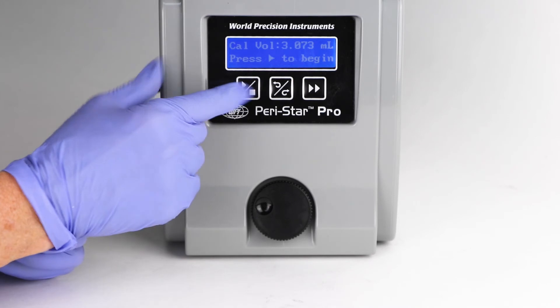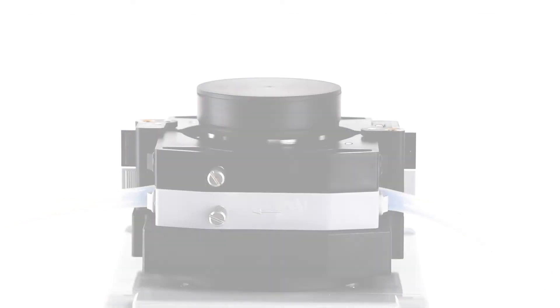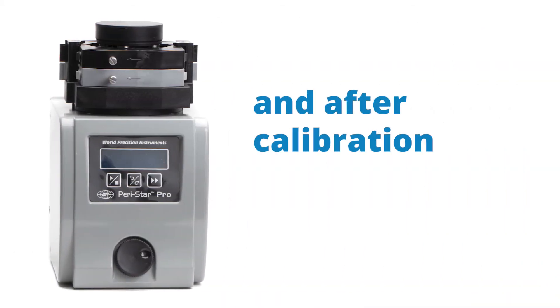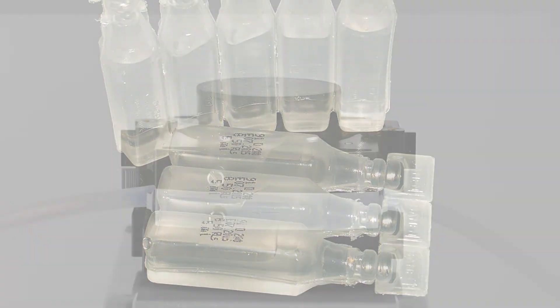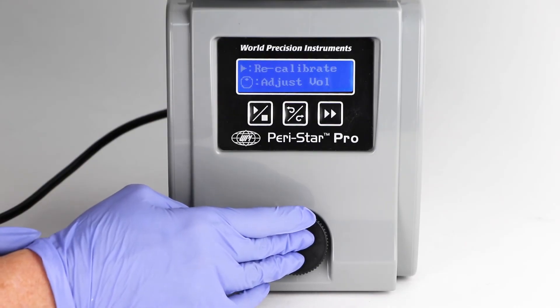Press the run/stop membrane key to begin the calibration pumping sequence. The pump automatically stops after the test time. Then calculate the volume by comparing the difference in the weight of the solution immediately before and after calibration. Distilled water may be used for the calibration. Several calibrations may be taken to get an average.